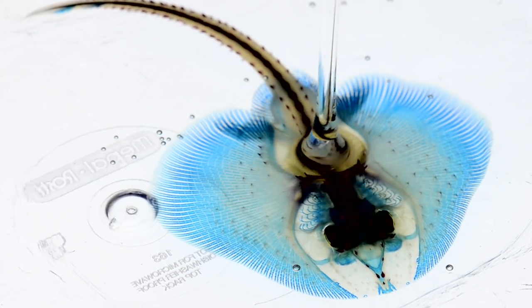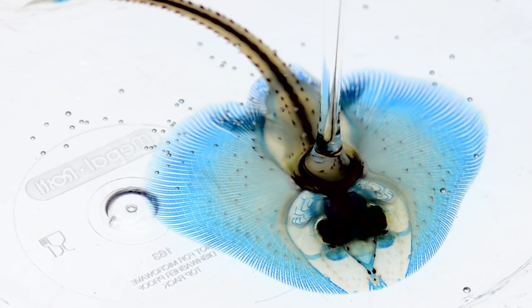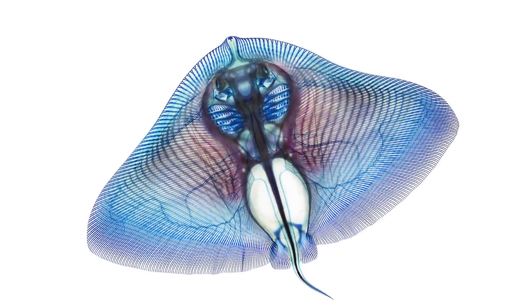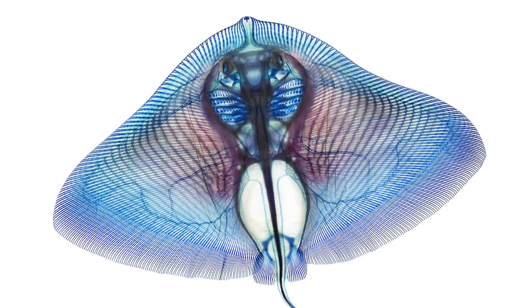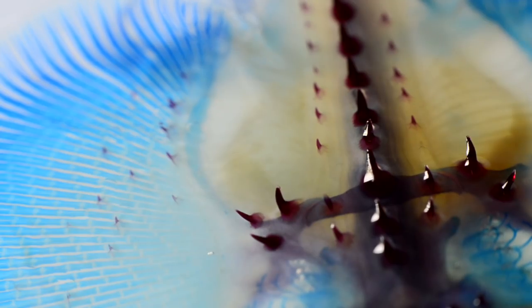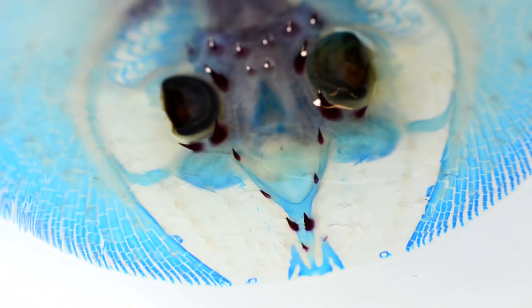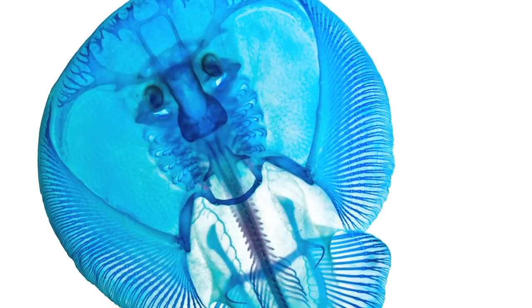It wasn't until I cleared and stained that whole animal that I saw the patterns of the joints and the wings forming these secondary arcs that were just visually arresting. It was absolutely beautiful. My artistic interest in them then drove a different set of scientific questions. Is this artistic element different among different species? And so we then cleared and stained a bunch of other specimens.